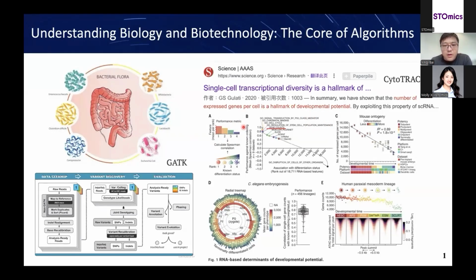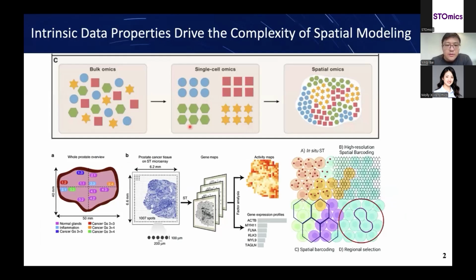So in our Spateo toolkit, we also use this concept to develop the algorithms. And many, many people ask me about why the spatial transcriptomics become so complicated to analyze, because there are already a large amount of well-performed single-cell RNA data analysis toolkit or software in this field.